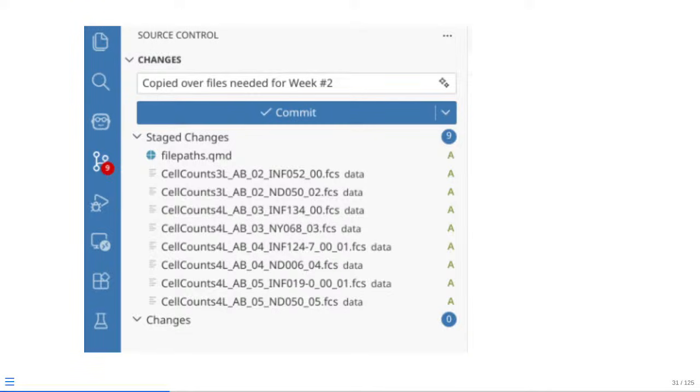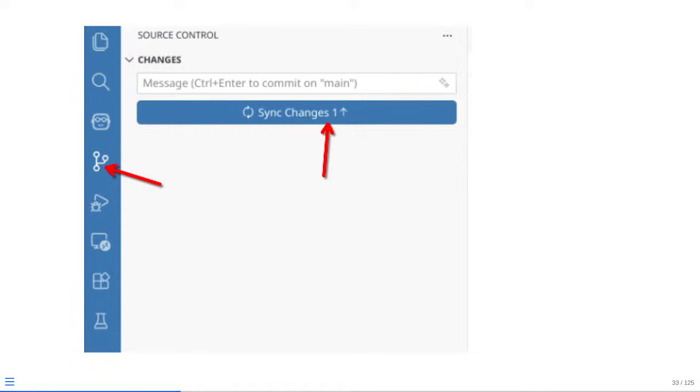So this is kind of what I will do for every single week as far as keeping my projects organized, but then also following along on the course. Just keep everything that you're doing as far as active code editing to one project repository of your own making. And then at that point, once you have committed everything and have it as a commit, just go ahead and send all those changes you made to your own project repository back to GitHub, so that worst case scenario, something happens to your computer between now and lunch, you would still be able to have those changes, that code and data sets that you have made available on the remote GitHub.